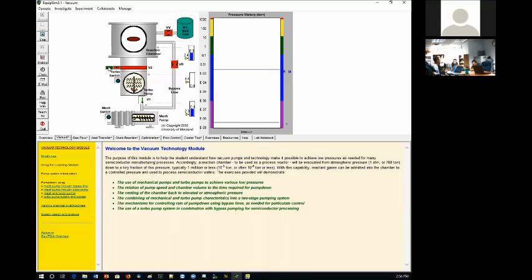So I'm going to open it now like this, and then the pressure will also drop down inside the chamber. Everything went down to crazy low. As soon as I open it, the pressure jumped up instantaneously because it was at a higher level first, but then dropped down again. So this is the point where I can continue with my process. I can do evaporation. I can do any deposition, like low vacuum deposition, high vac deposition, I should say, sorry.